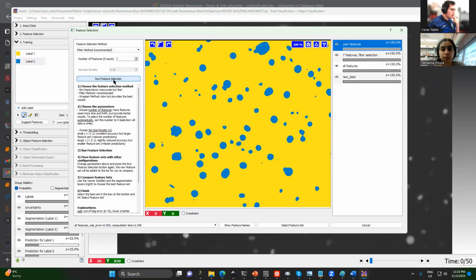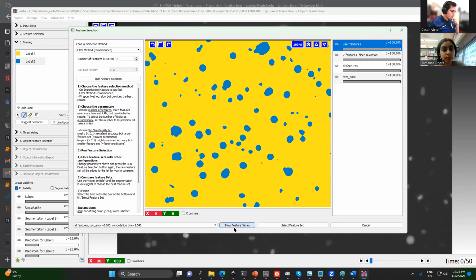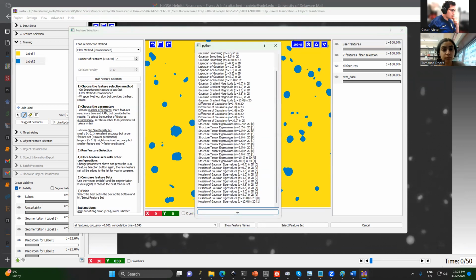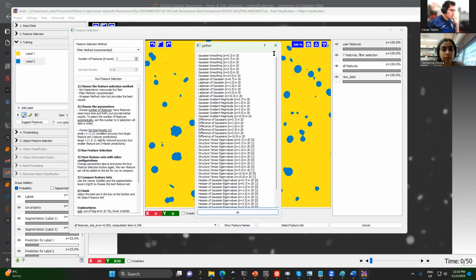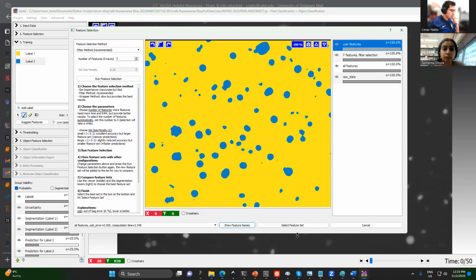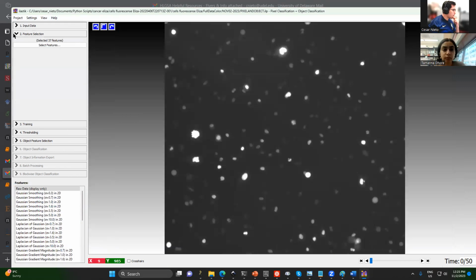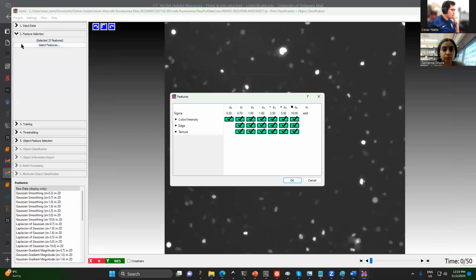Okay, so these guys, which feature select? Okay, so it seems that this guy selected all. No. Yeah, yeah. Okay, let's start first.